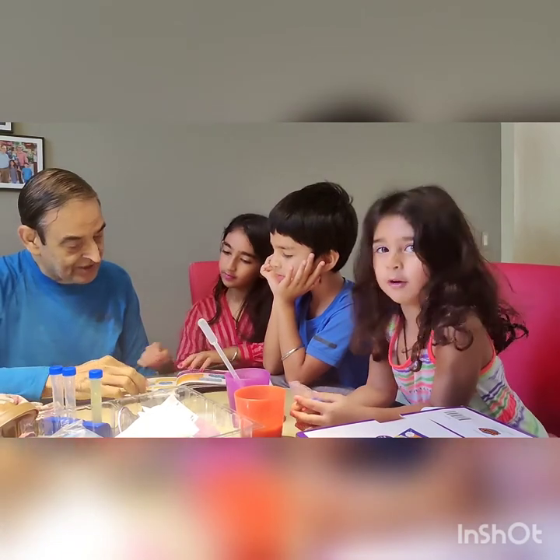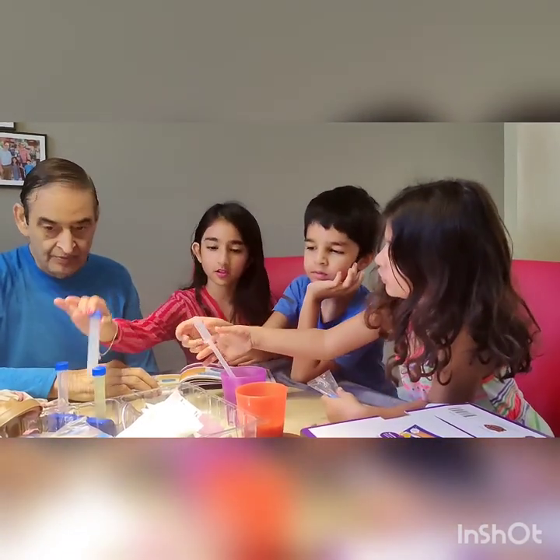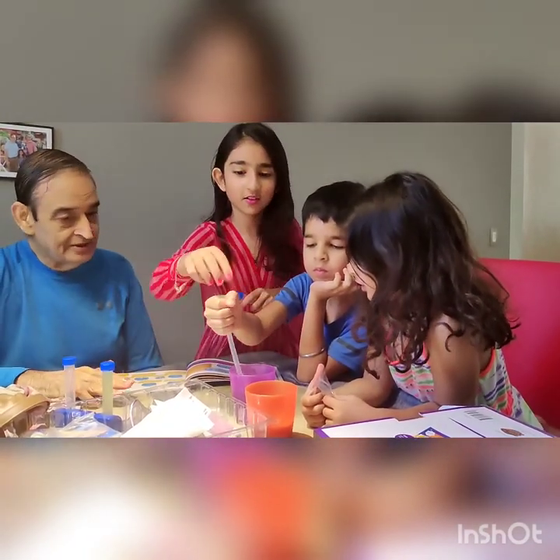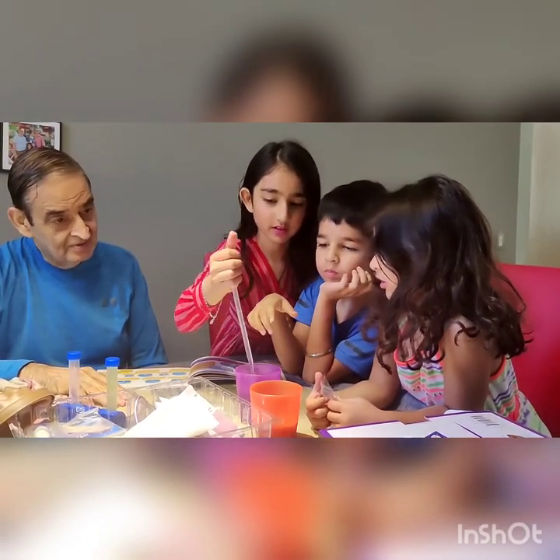No, let's first read. Pour 5 ml of water into the test tube. No. First we'll read. No. First you read fully. I like doing this, then you guys can do the rest.